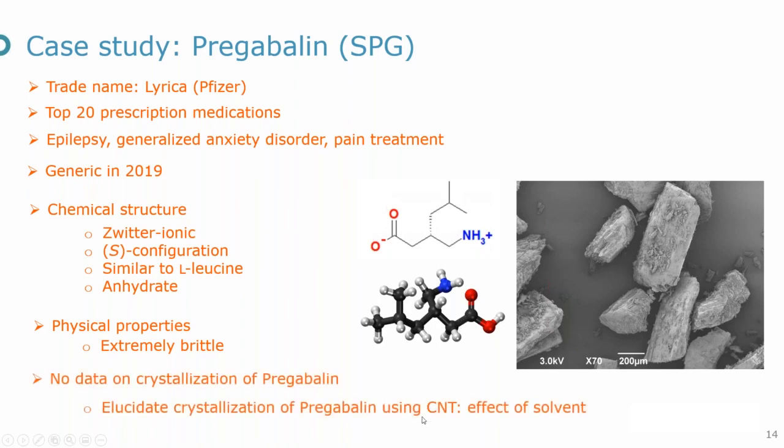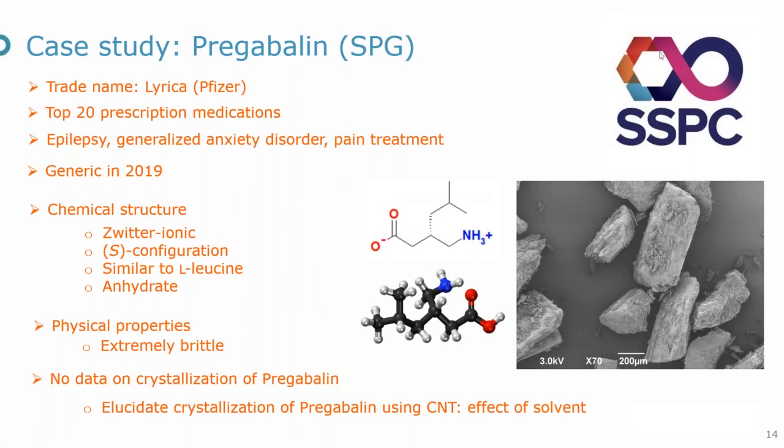So we were interested in investigating this compound to elucidate basically the crystallization of this API using the classical nucleation theory, and see how the solvent choice impacts the crystallization of this API, and perhaps to come to a better form. And I should mention, this work has been done in Limerick in the SSPC, the Synthesis and Solid State Pharmaceutical Center.